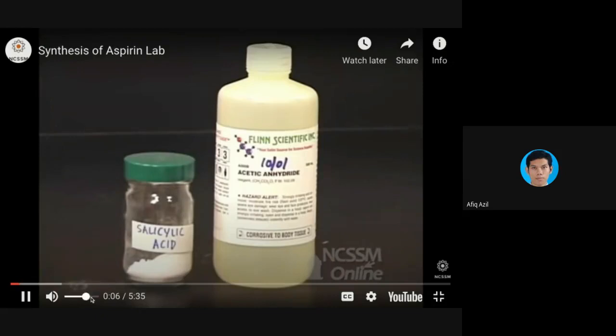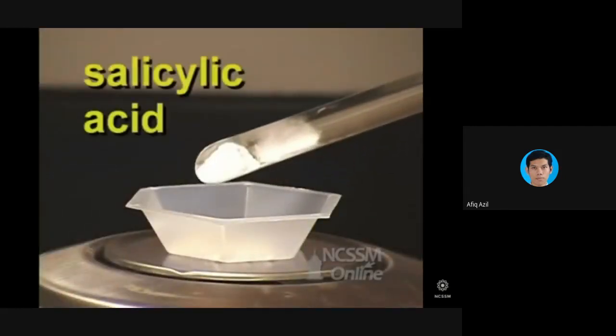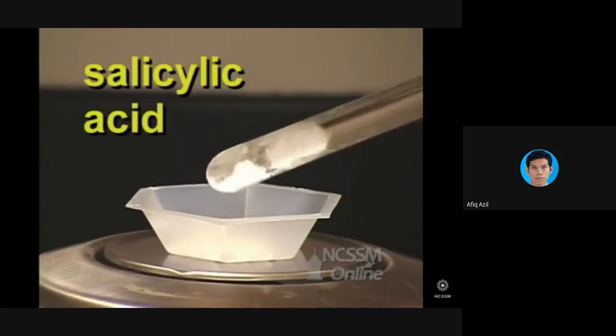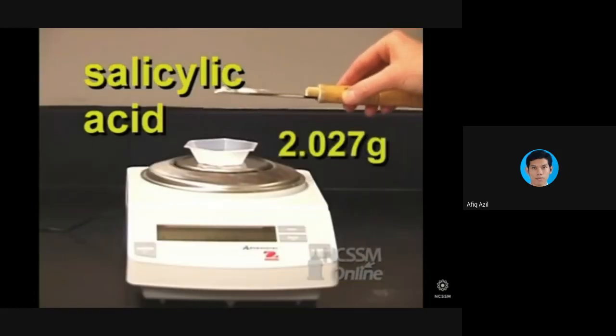Today we're going to make acetylsalicylic acid. That's the scientific name for aspirin. And you make aspirin by combining salicylic acid and acetic anhydride. We want to weigh out 2 grams. Okay. Actually, we have 2.027 grams. So record that number.